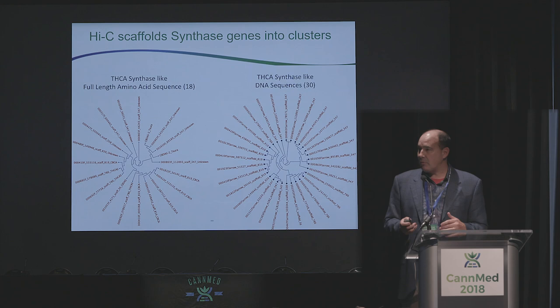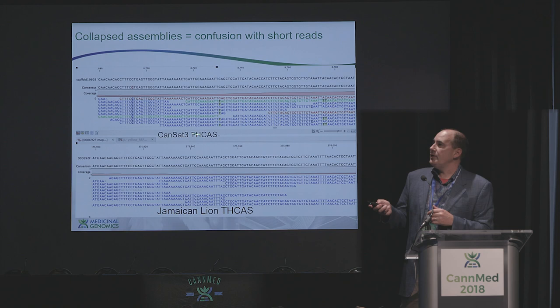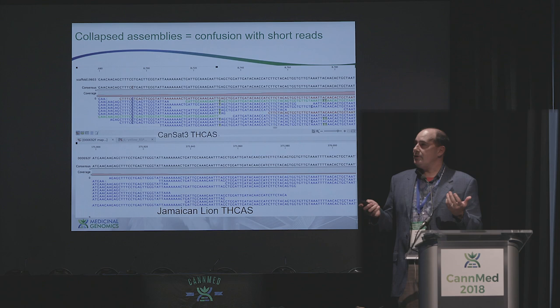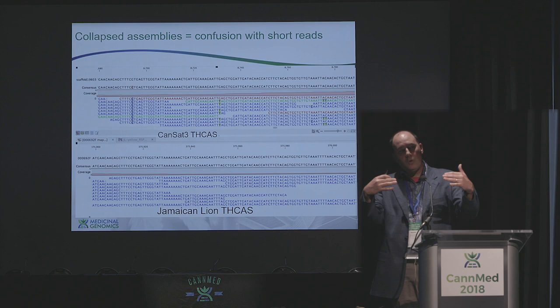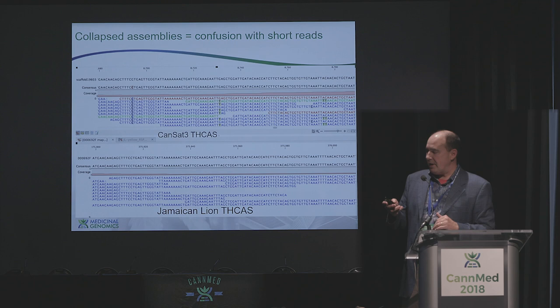Now, in terms of assay development, as Philippe was touching on, this is what we were dealing with before: a mapping to the references that were made back in 2011. And if you're not careful when you map to these genomes, these blue reads are paired reads. That means they're Illumina reads where you have a forward and reverse read, and they both map to the genome. The thing highlights it blue. Red and green are ones where we can only map one of the reads to the genome and not the other, and so something's wrong, and those ones you should always discount as to whether or not you should trust them.